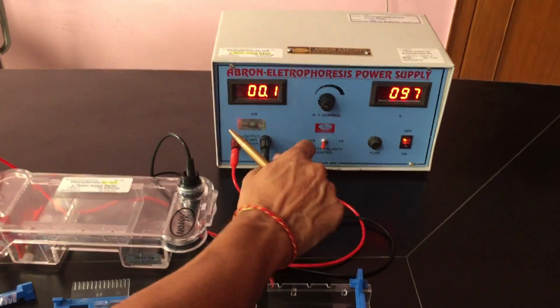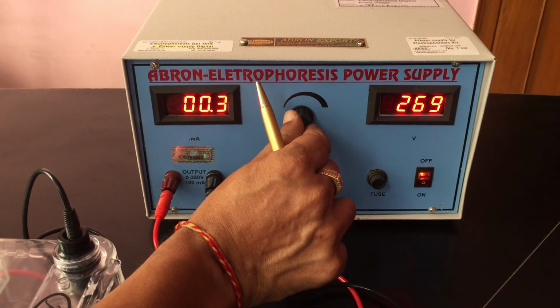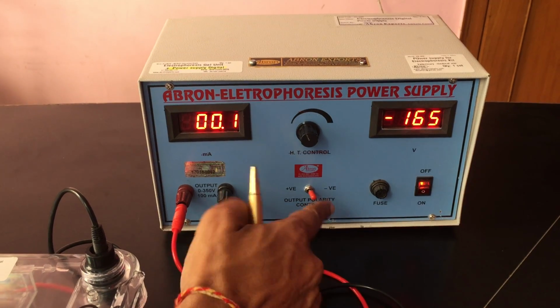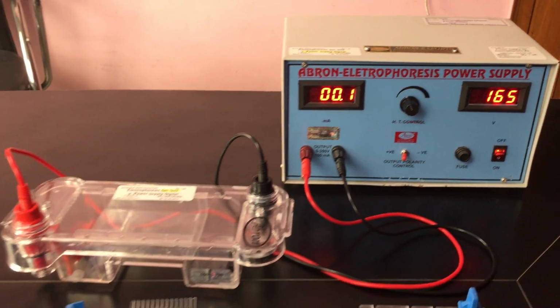This is a power supply. We can set it up to 300 or 350 volts, and I am putting it here now. I can make it positive or negative. This can be changed. This is connected to the power supply and the gel apparatus.